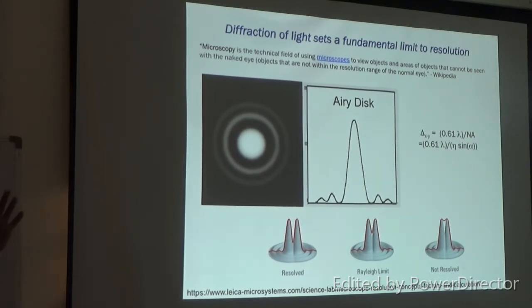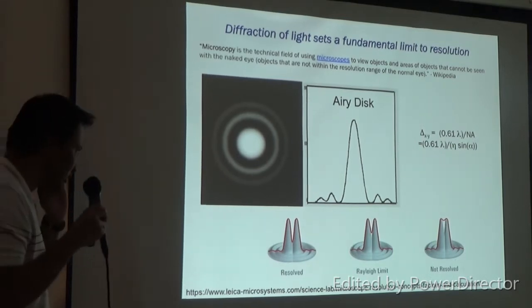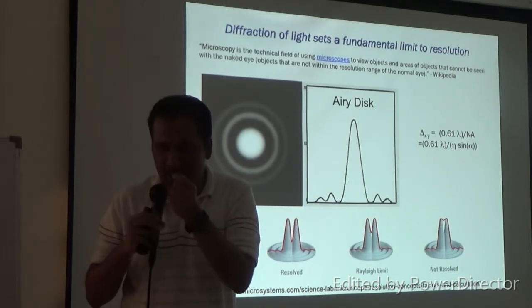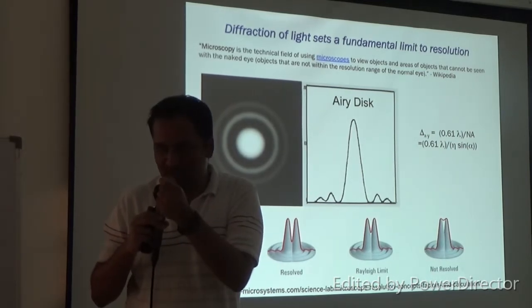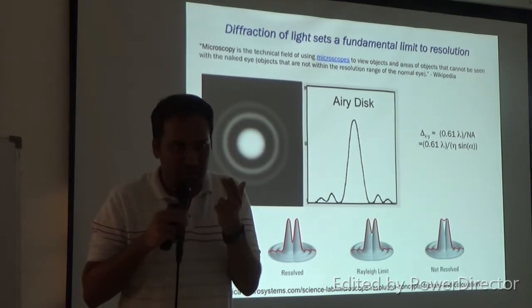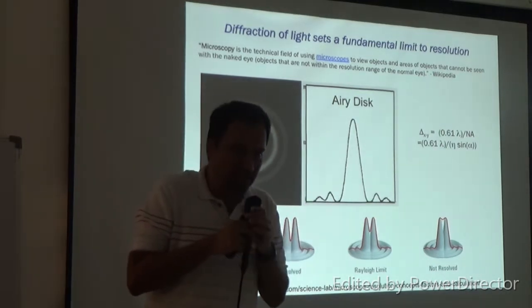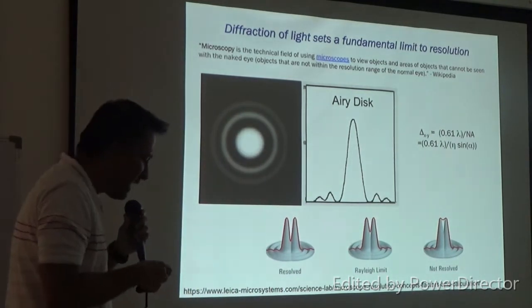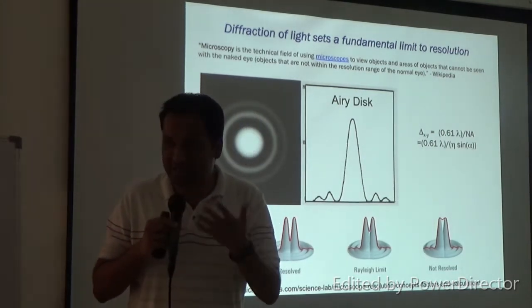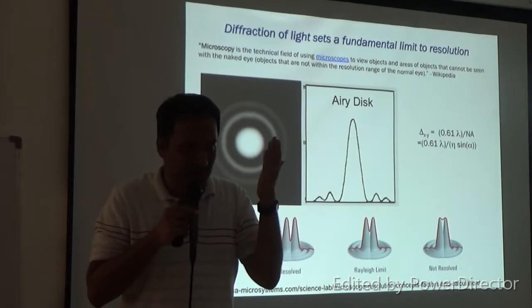What is the numerical aperture of the lens? It's n sin theta. What that is, we'll define soon enough. Ultimately, what is the problem? The problem is to distinguish two very small objects which are very close to each other. How close can they be before you stop distinguishing them as distinct objects? Any point object, because of this phenomenon of diffraction, what is diffraction? Diffraction is the bending of light around the edges of an object.